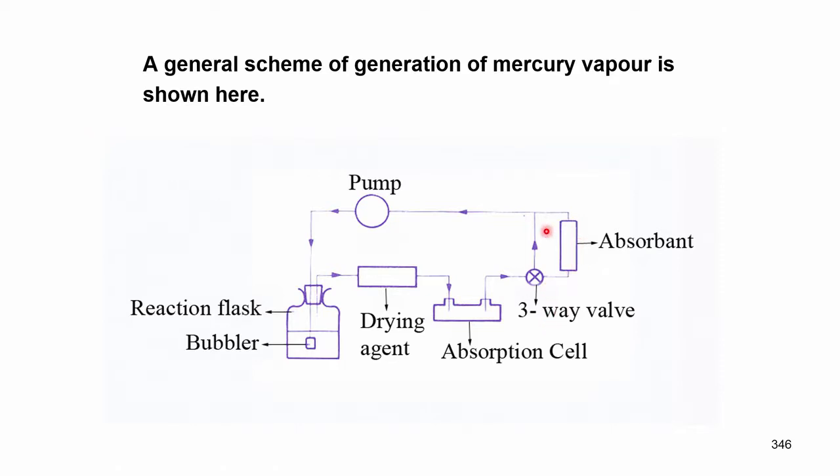Sometimes we need the drying agent, a very important aspect of determining mercury.